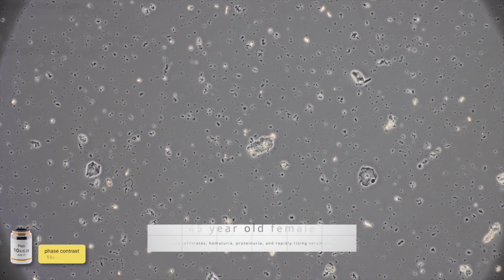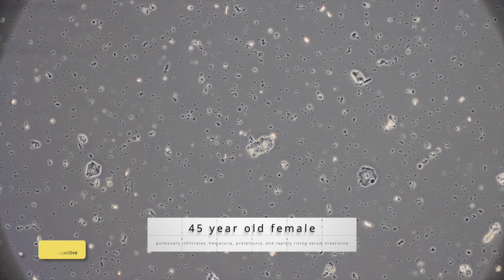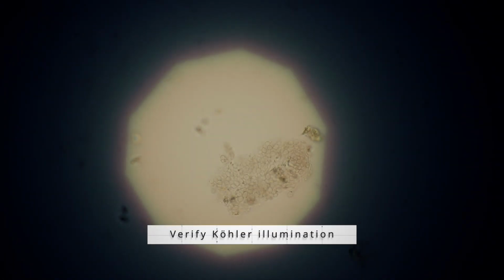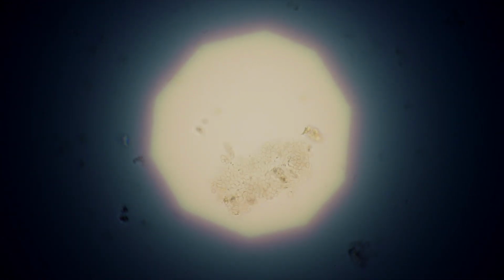Here in this next case, we have a 45-year-old female with diffuse pulmonary infiltrates, hematuria, proteinuria, and a rapidly rising creatinine. This looks like a cast under low power phase contrast. We're going to go in for a higher power view with the 40x objective. First setting up Kohler illumination. We'll center the image of the field diaphragm and open it to fill the field of view.